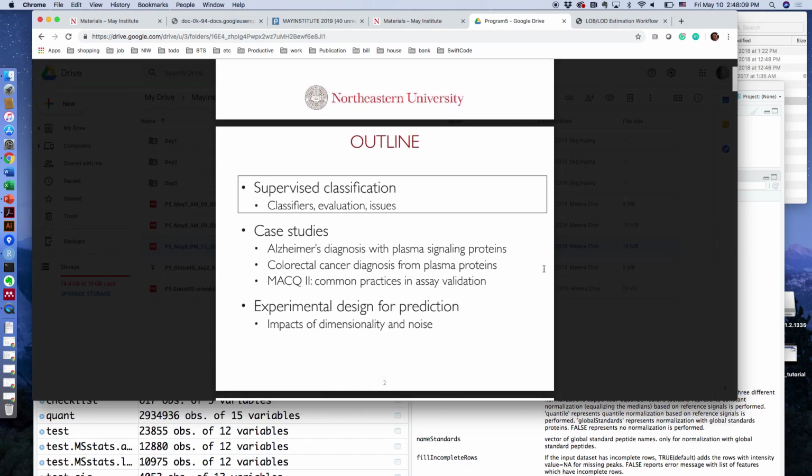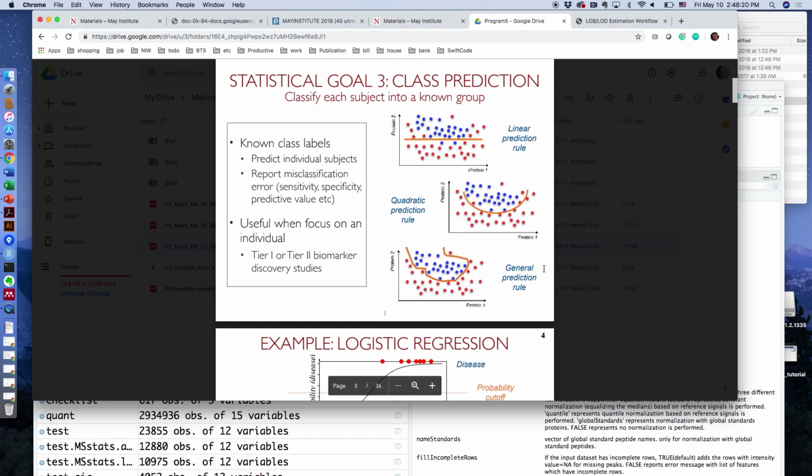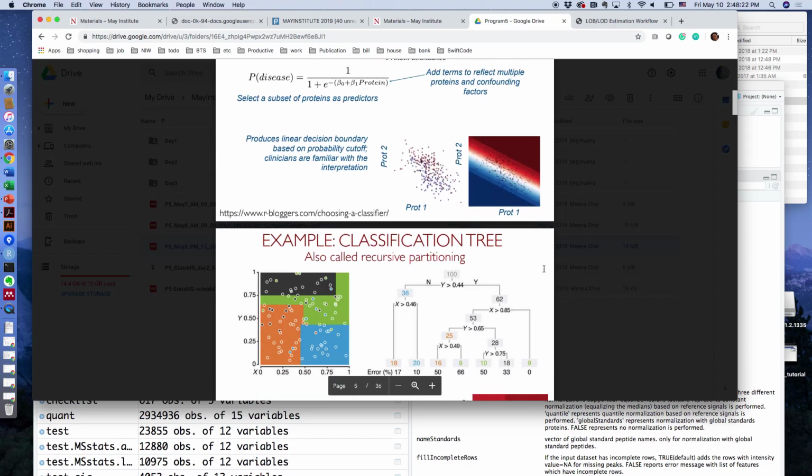What is after MSstats? MSstats just shows the proteins detected as significant, but this is more about how we can apply the protein quantification by MSstats for the biomarker study. So you can also see the YouTube video for this part. Maybe it will be good for you when you think about the experiment design.